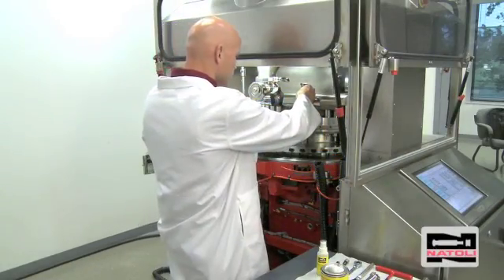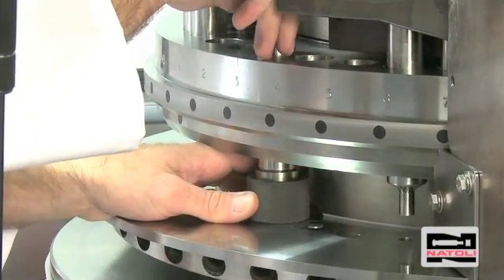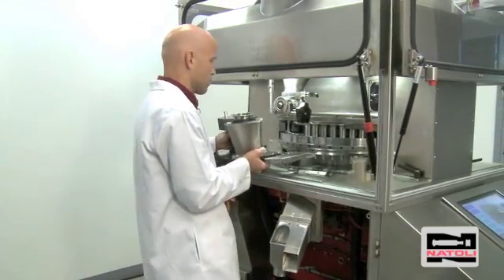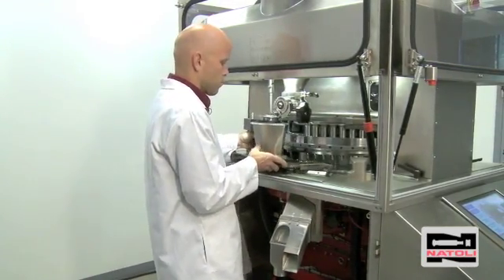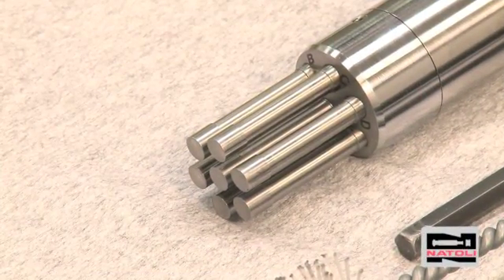Natoli Engineering produced this instructional video to teach tooling installation and press setup in a rotary tablet press. This video will also detail how to set up the press in a thorough step-by-step approach. Now we will demonstrate how to load multi-tip tooling.